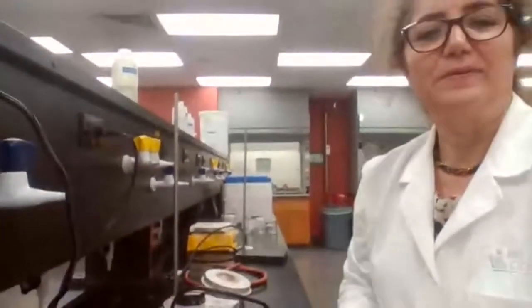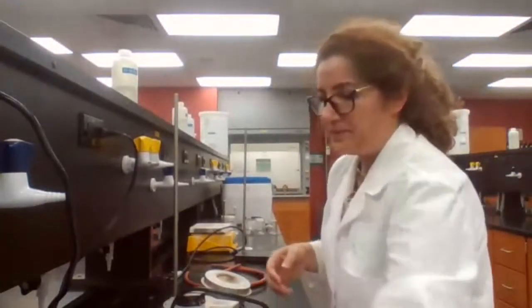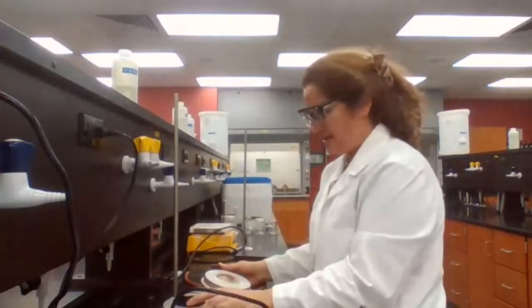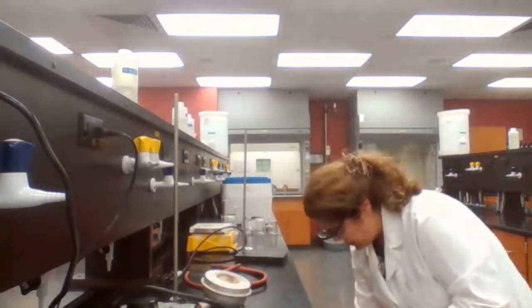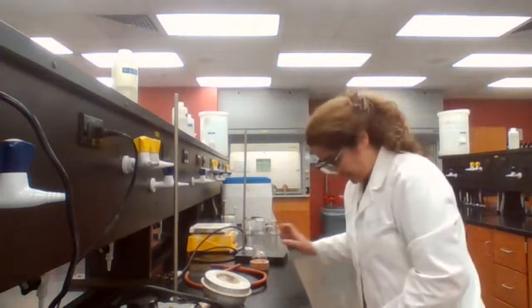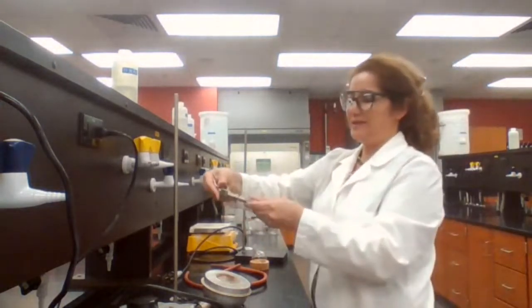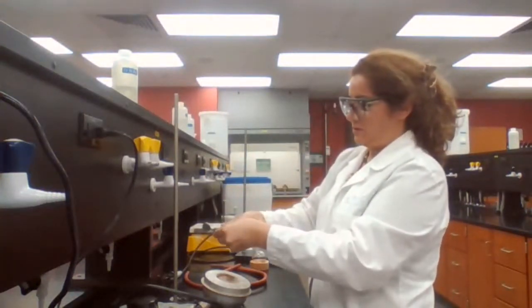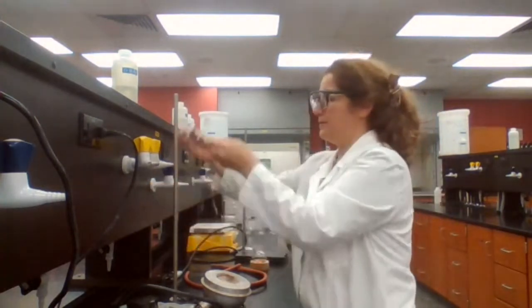We are going to start setting up the equipment first. We talked about setting up reflux last class. Basically, I'm going to bring the hardware out first, and then the glassware. Glassware is going to come out last. We do need a utility clamp to hold the boiling flask.